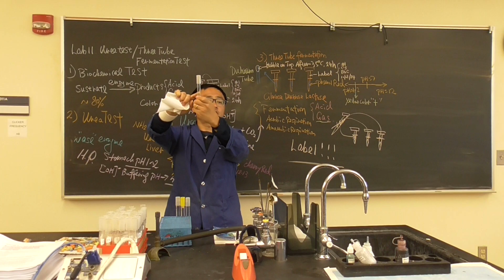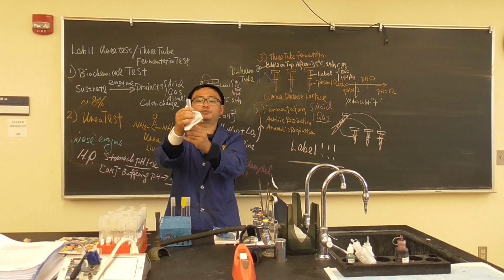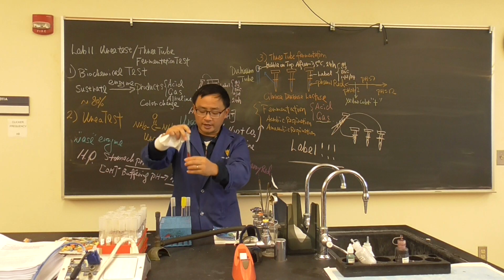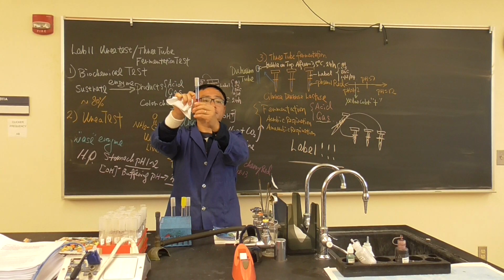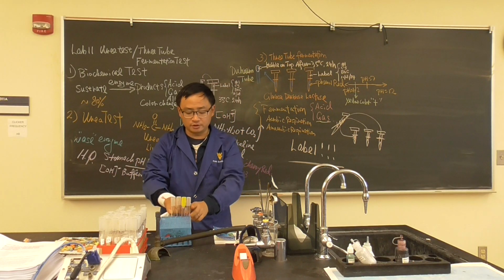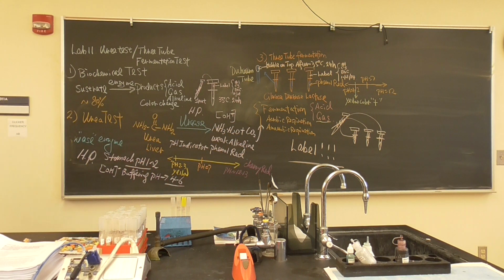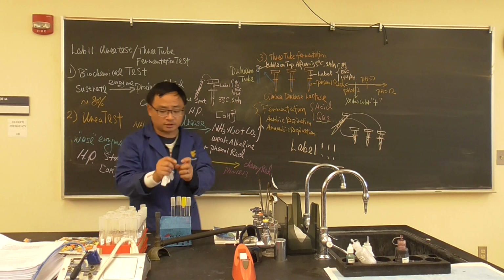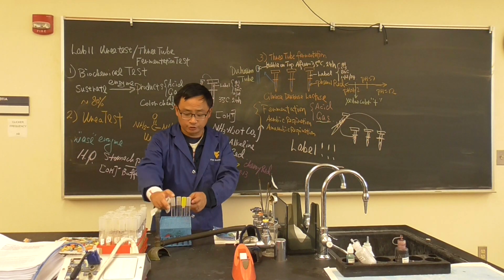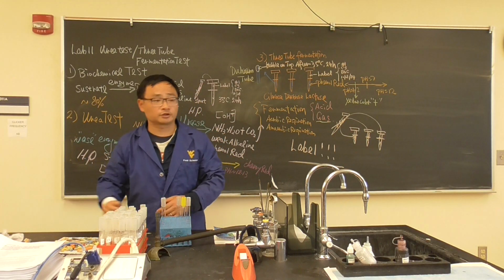Label always on the top, okay? You see the condensation of the liquid? Use paper towel to dry, and then label them on the top. These two look very similar. You even need to label what they are, because they look exactly the same. So make sure you grab it, go back, and immediately label which sugar it is. Urea looks different, and then you assign the culture.